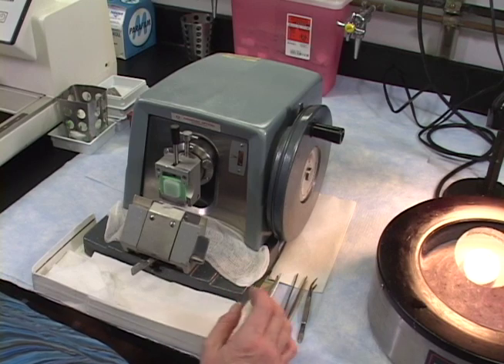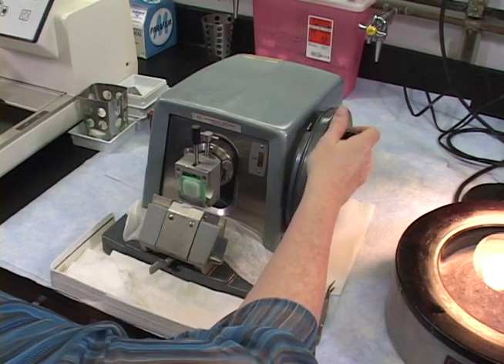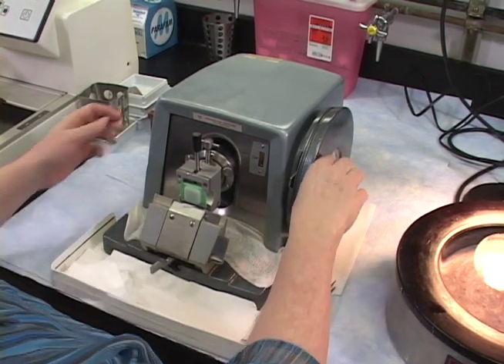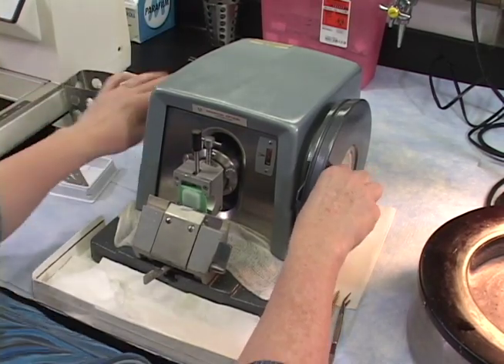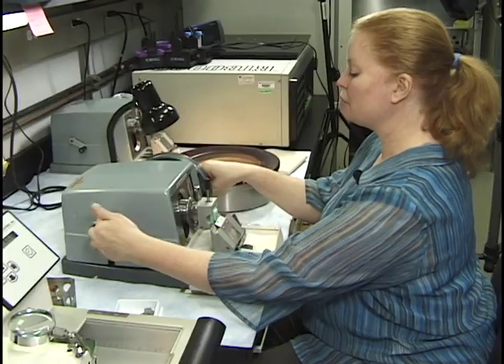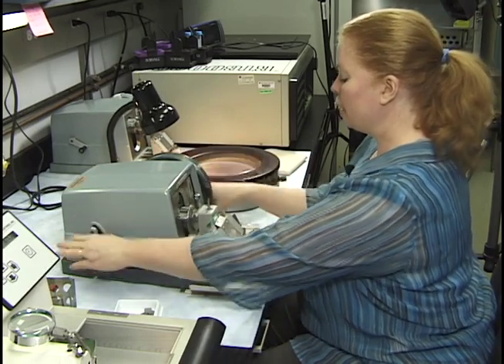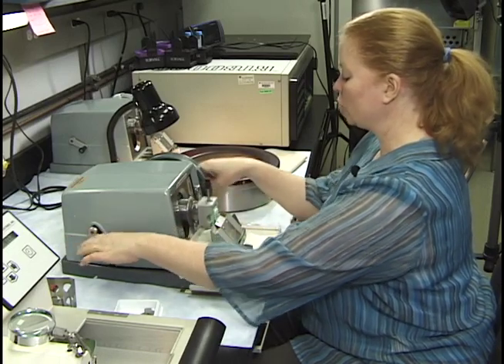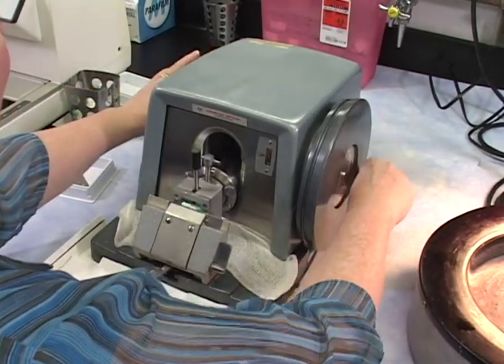Okay. So we went over adjusting the microtome. As we see on this particular block, we're going to pretend, even though it's a blank practice block, which I'll show you when we get to embedding, you can make yourself a few of these for practicing. We're doing the facing. So I used one of my old knives that I saved for facing. And I'm rocking this side forward, and then as I'm turning the advance and retract wheel, I'm rocking the flywheel. Now, again, newer microtomes do not like this rocking motion. Newer microtomes would be better if you do the full rotation as you're advancing.